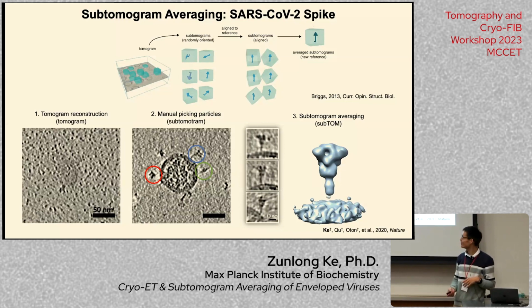Well, it's not really relevant to what I do, but there's a study showing the mature capsid goes into the portal of the nuclear pore complex, kind of in between. That's actually a study with Hans Georg and Martin Beck at EMBL. It's not anything I do. I actually worked on that project. It failed, but it seems like they can.